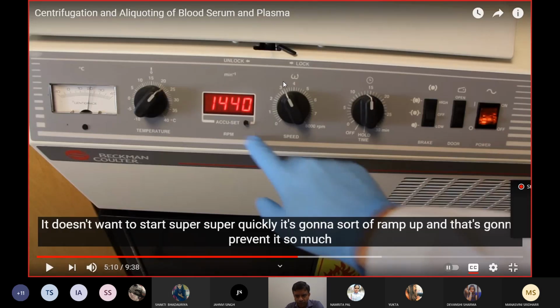So this will go up to whatever you have set here. In this case, you have set it around 3000, right? So again, you can standardize. What you can do is 3000 at a particular time period. Just for standardization, some people increase the speed and reduce the time, or you can increase the time and reduce the speed. It all depends at what time and speed you are getting the best outcome.